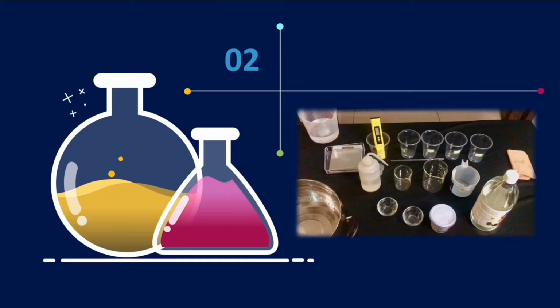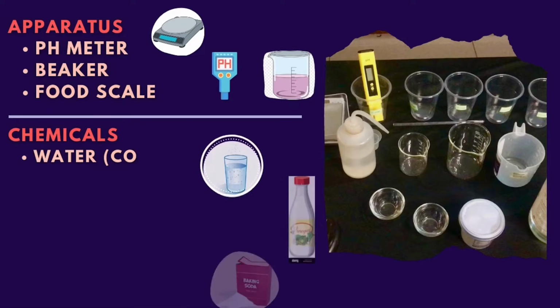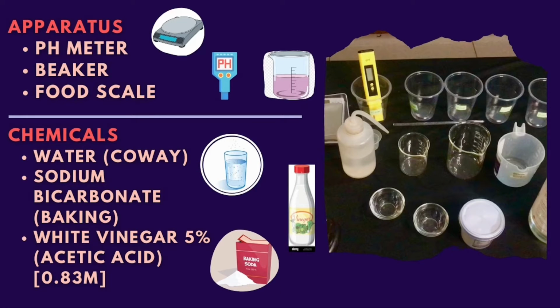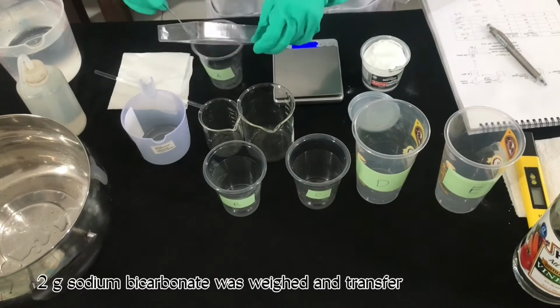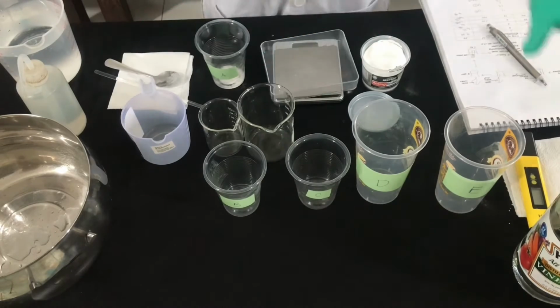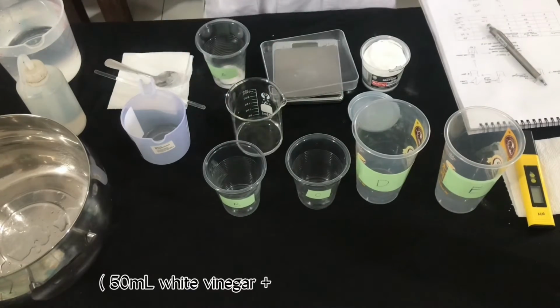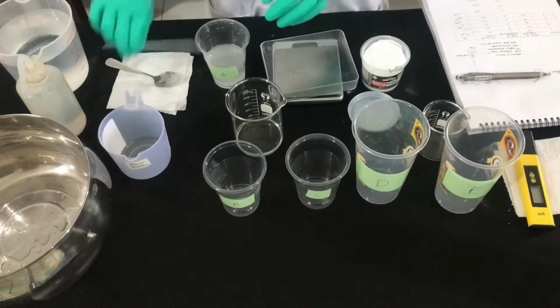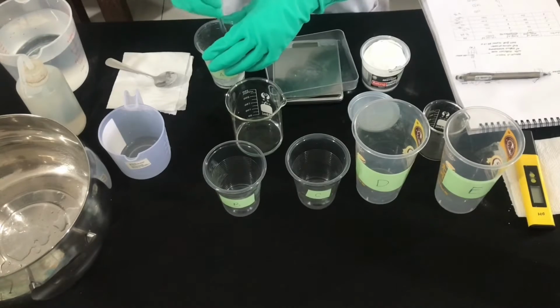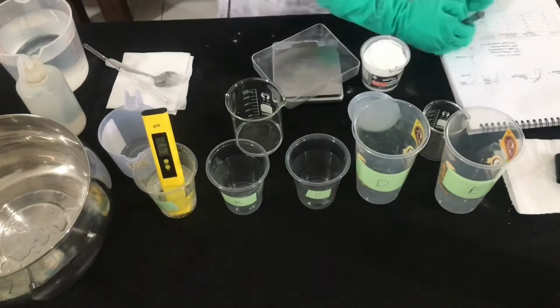Now, let's proceed to procedure Part B, which is the pH of buffer solution. For Part B, we just need a pH meter, beaker, food scale, cold water, sodium bicarbonate, and white vinegar. 2 grams of sodium bicarbonate was weighed and transferred into plastic cup A. Then, 50 ml of 0.83 molar white vinegar and 50 ml water was added. Next, the solution was stirred until all the sodium bicarbonate was dissolved. The pH of the solution in cup A was measured and I get 4.77.